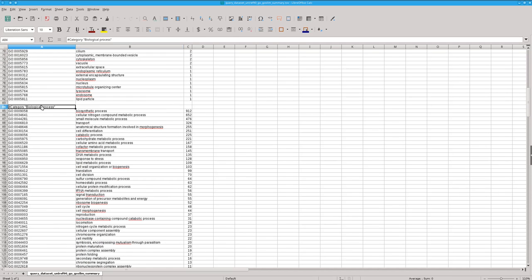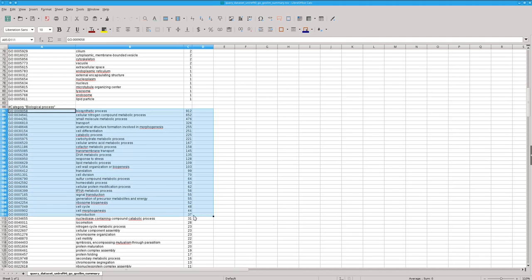This list can be used to easily create, for example, figures.